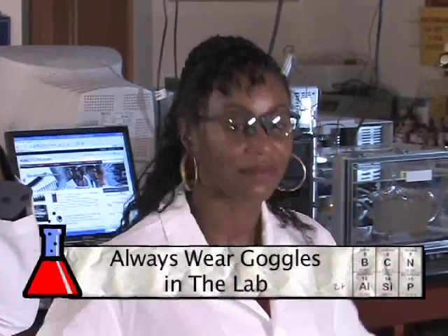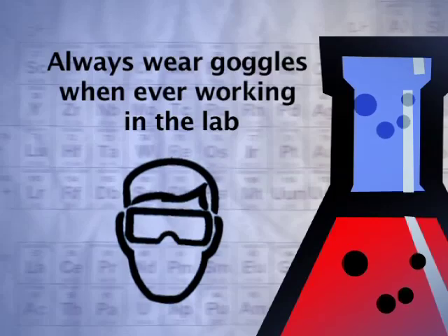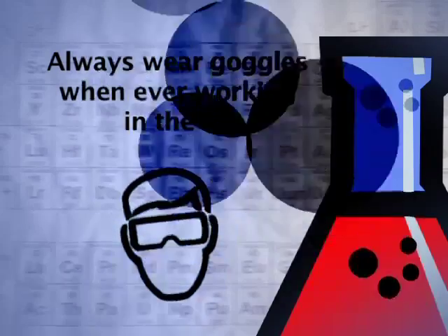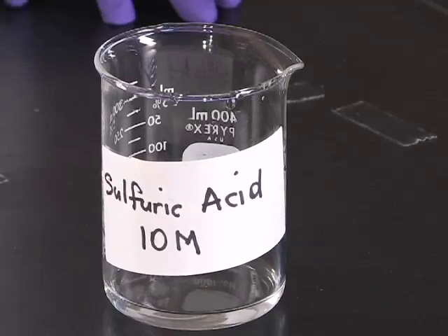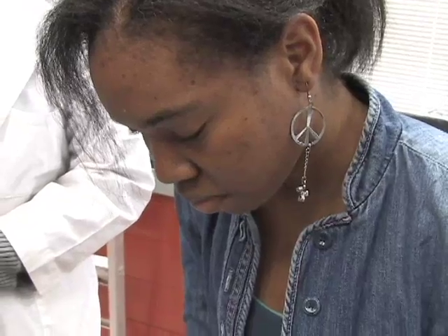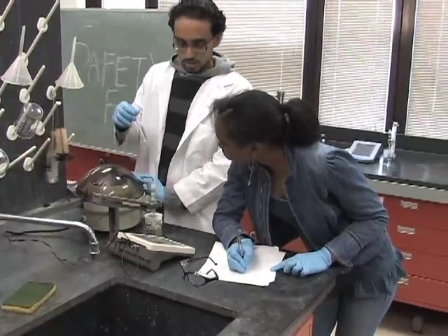Many materials in the lab can cause eye injury. To protect yourself from possible injury, always wear safety goggles whenever you are working in the lab. Remember that damaging materials do not care if your actions cause them or not. Even if you are not doing anything that might injure your eyes at the moment, someone else might be.